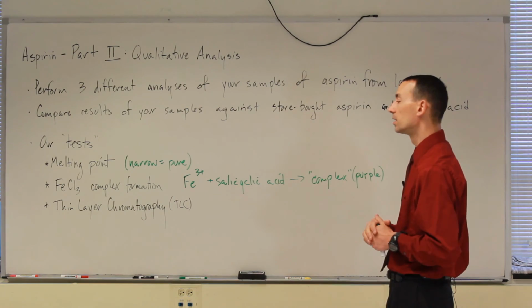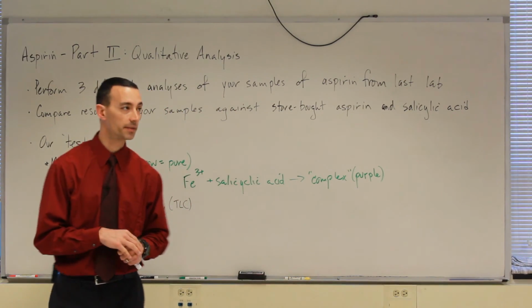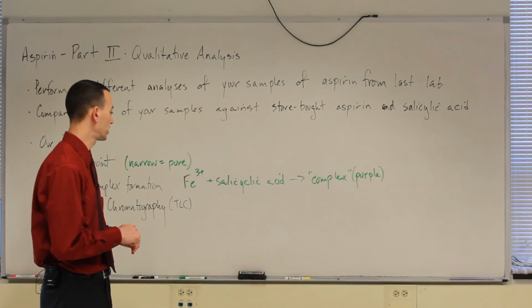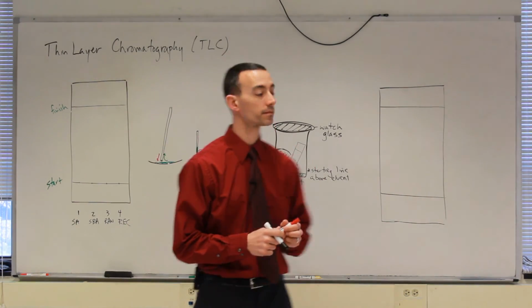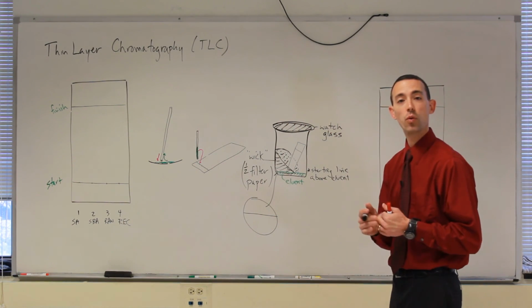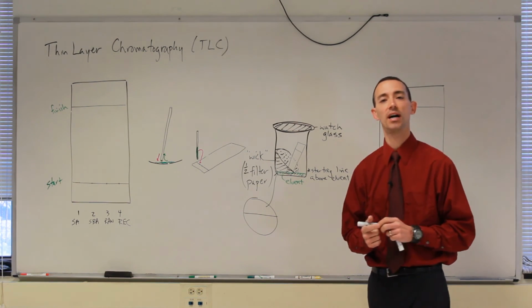Okay? The last experimental test that we're going to perform on our samples is known as thin layer chromatography. All right? In a second, I'll get the board erased and I'll tell you a little bit more about TLC. Okay, so I've got it set up here now to describe this last qualitative test that we're going to perform on our aspirin samples this week. It's called thin layer chromatography.